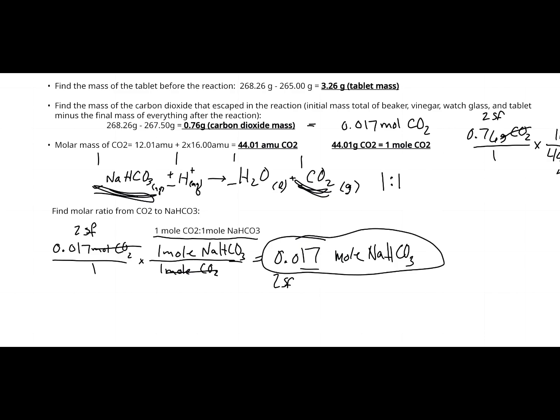And now I've got to figure out how many grams that is because I wanted to know what my percent composition was, but we don't really give a percent composition in moles when we're giving amounts of things in the real world, right? We only use moles when we're mathematically calculating what we're dealing with.